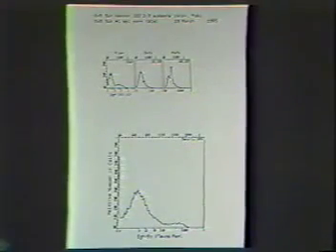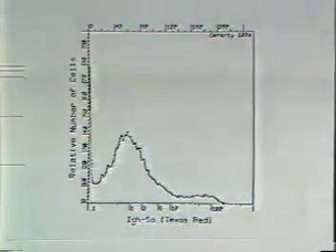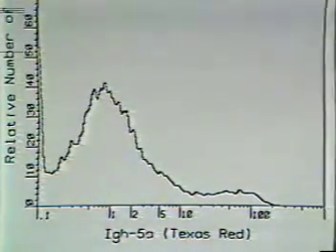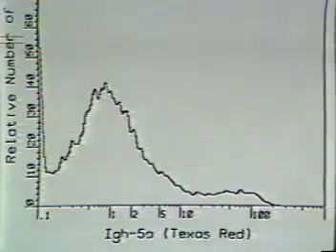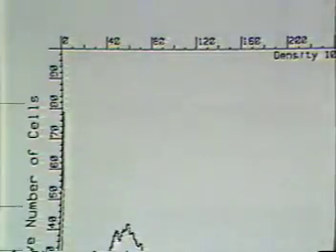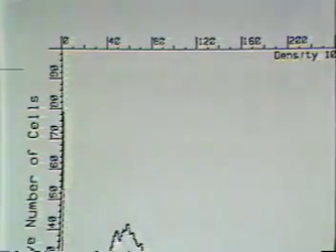On a histogram output page, the requested distribution appears in a large box on the lower half of the page. The x-axis is marked with a logarithmic scale, indicating that logarithmic data was collected for Texas Red in this experiment. The upper edge of the box is scaled linearly from 0 to 250. This scale is used for determining gating boundaries. The type of curve is labeled in the upper corner of the chart. The percentage figure indicates the vertical scale used in drawing the curve.